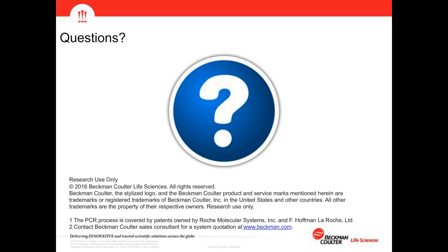How do I get support for developing methods not on your list? Do I need to wait until your team provides them? I can take this one. So we do have a pretty exhaustive list of applications that are demonstrated or qualified. But if you happen to have a requirement for an application that's not on the list, then we do have a field team that covers the U.S. to globally, actually, to be able to handle those specific needs and develop methods out in the field.